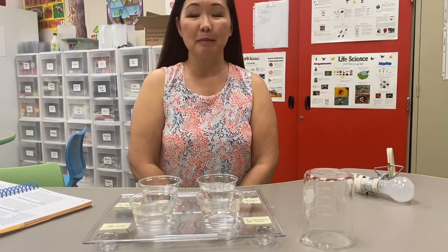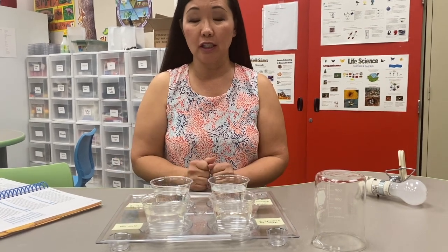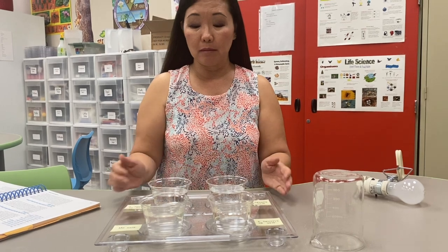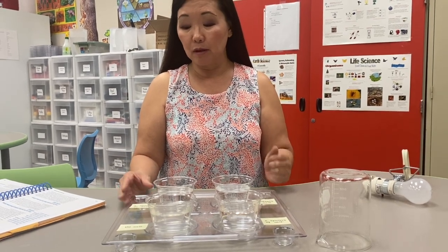Hi everyone, Ms. Patsy here at Castile Innovation Lab. We are looking at the brine shrimp that we were trying to hatch. It's been three days since we added them to our salt solutions, and we're going to go ahead and look at the results.